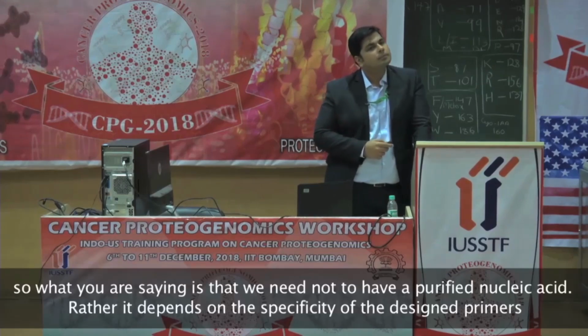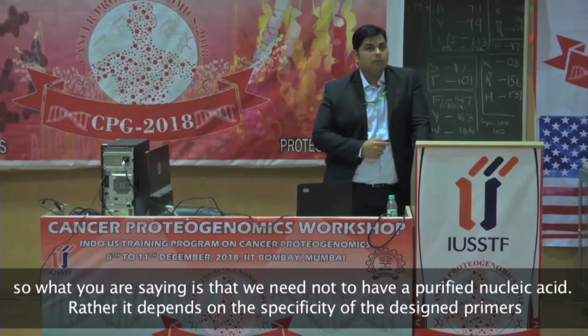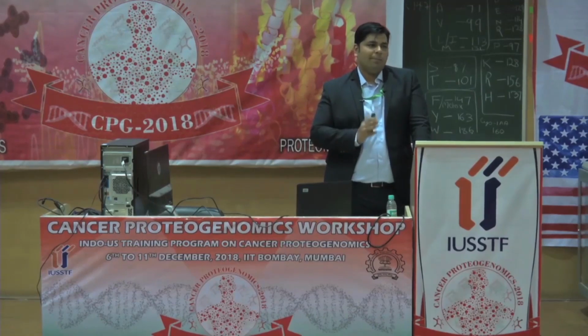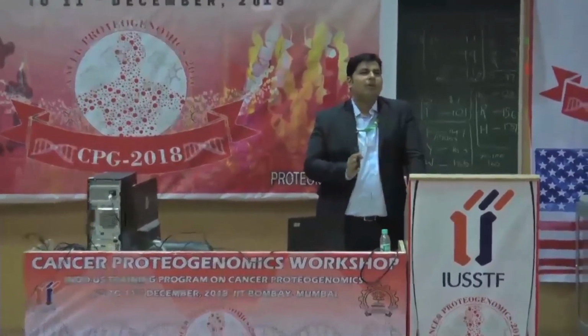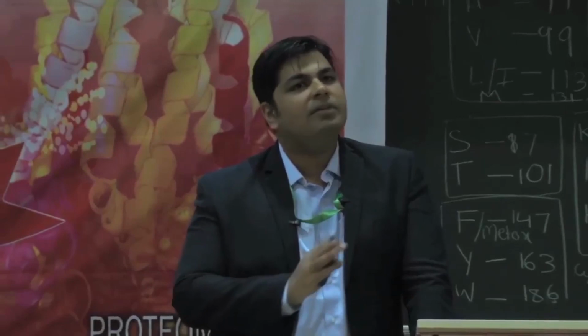When you are talking about a mutation, if there is a single slip, the primers that you are using are specific for this. Yes, so that's when you get those. Absolutely. The best amplification results you will get with this don't depend on the quality of your nucleic acid. They depend on the specificity of your primers. If your primers are specific, the data you will get is absolutely specific. The quality of nucleic acid would not hamper your data.